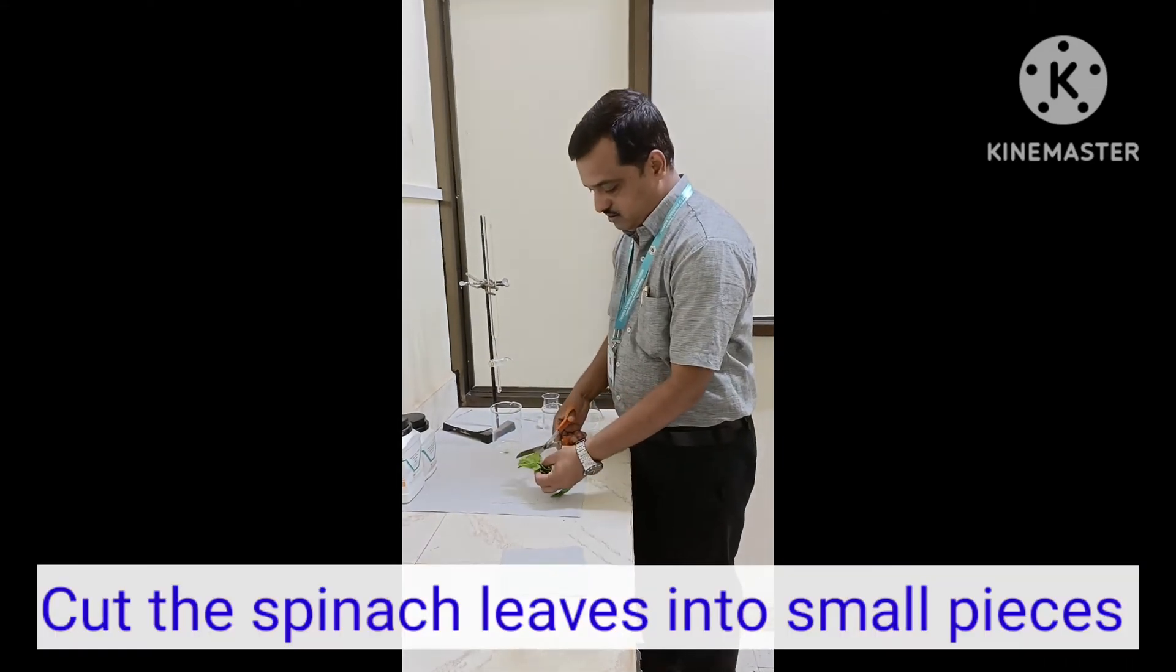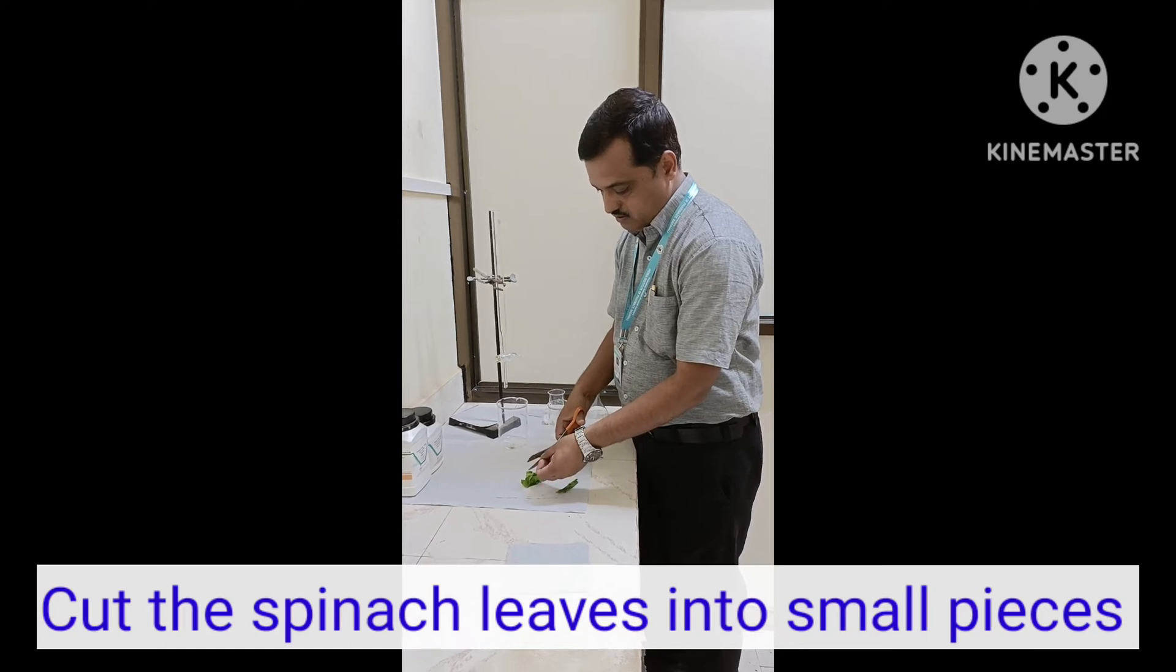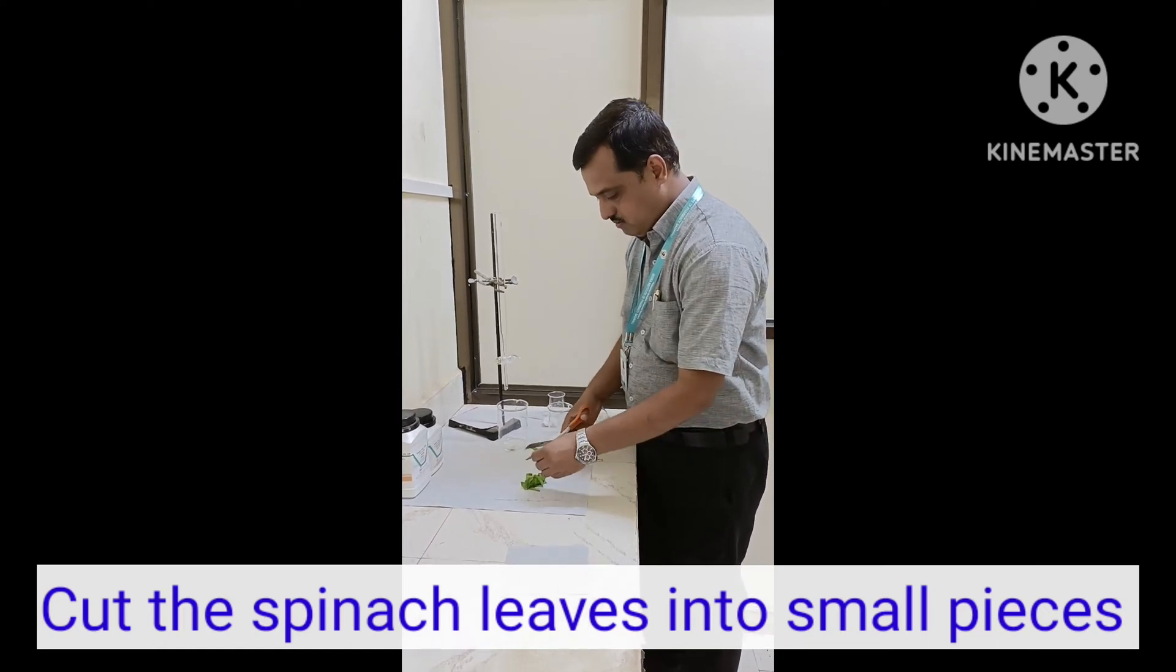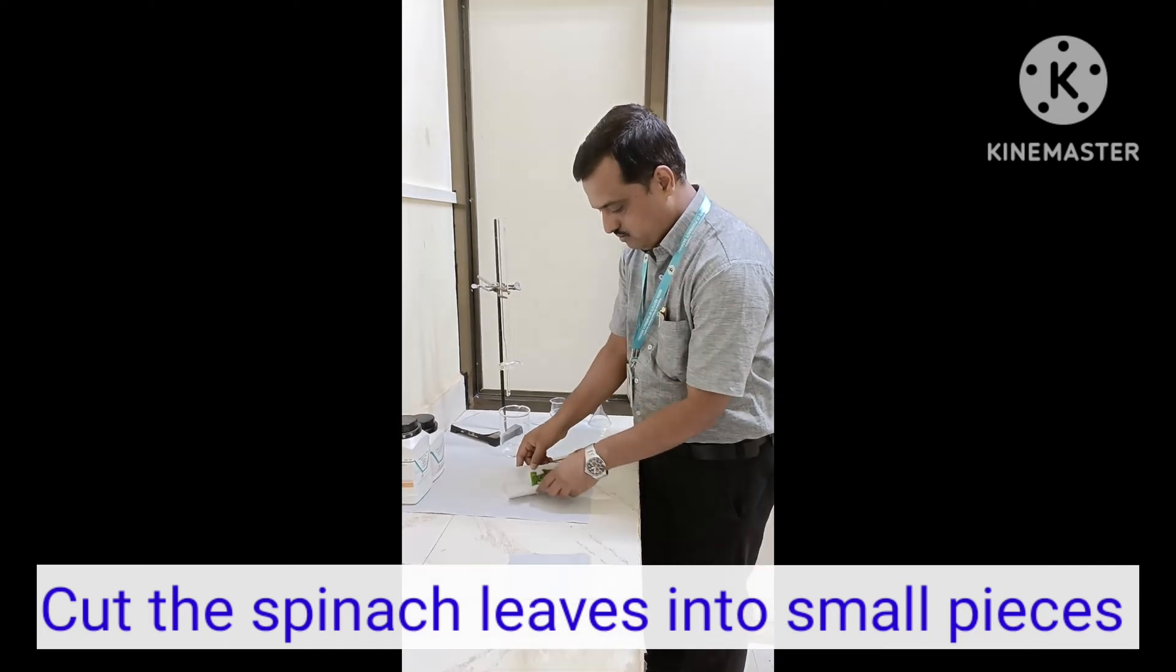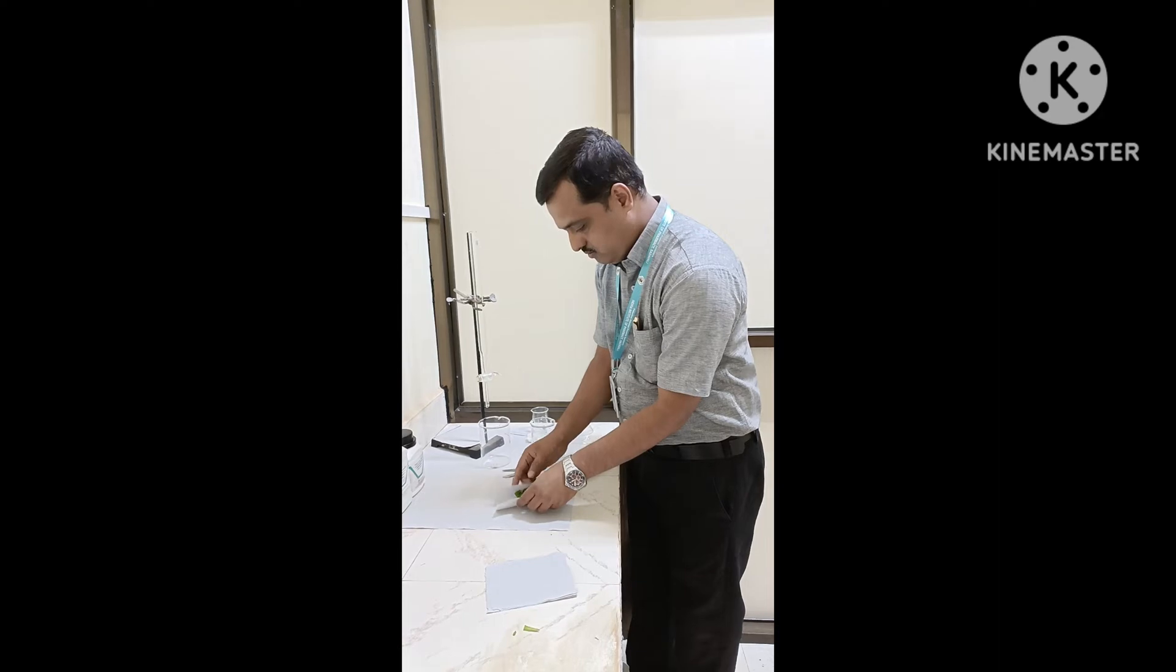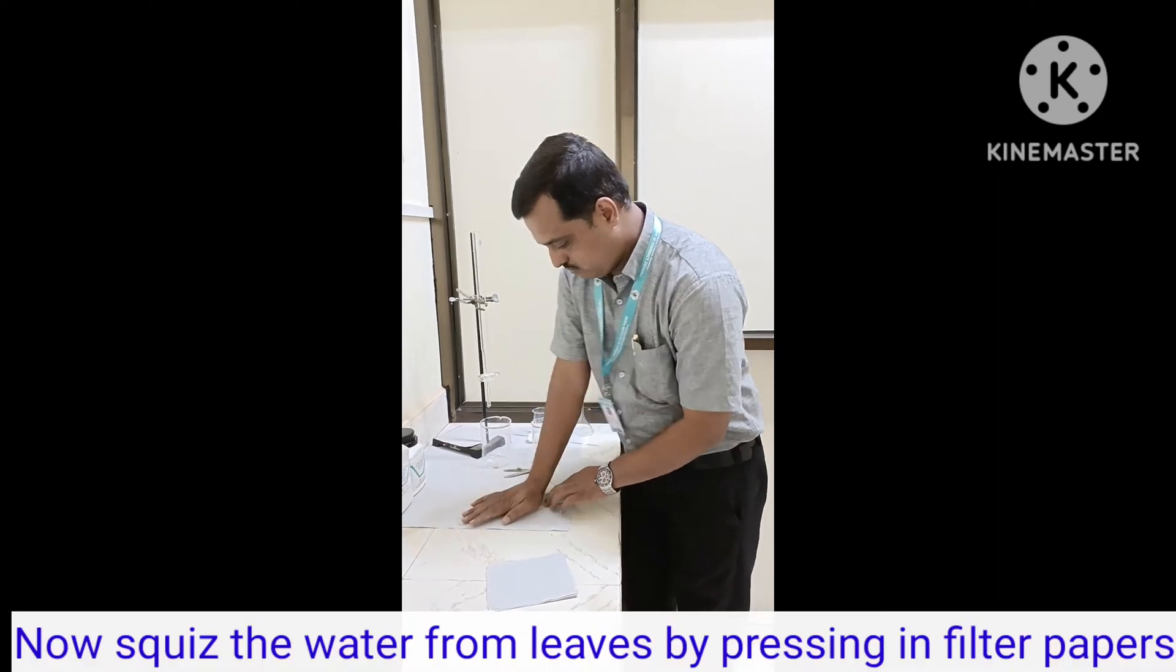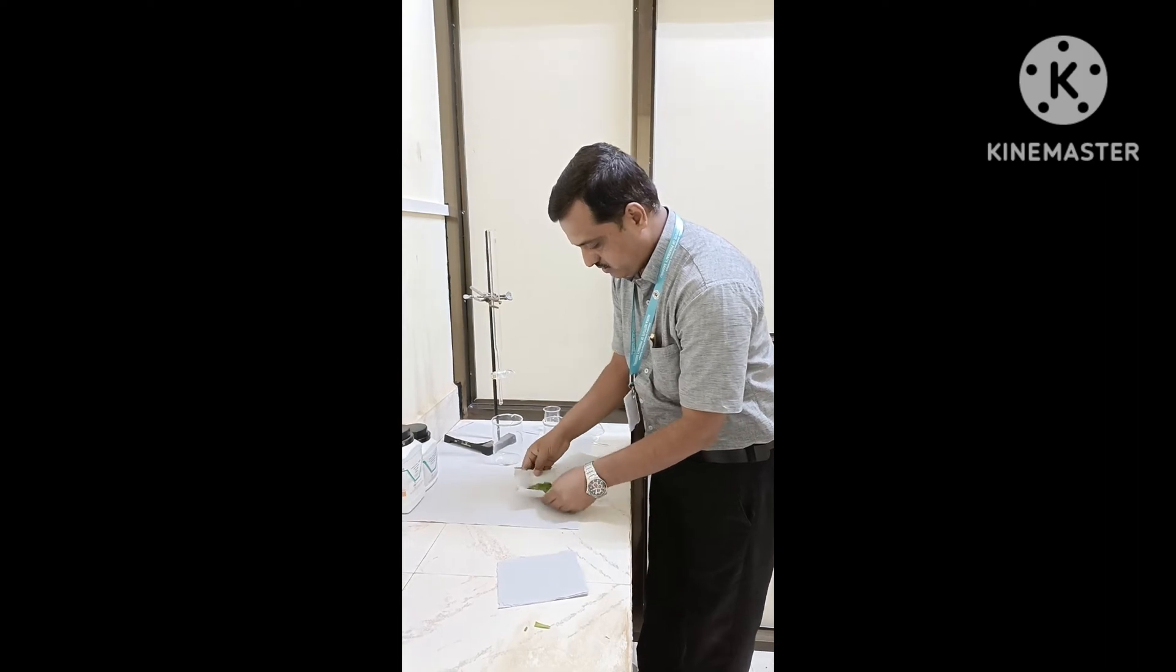Hello friends, this video demonstrates separation of beta carotene from spinach leaves using simple column chromatography. First, we need to take fresh spinach leaves, cut them into small pieces, and then squeeze them.